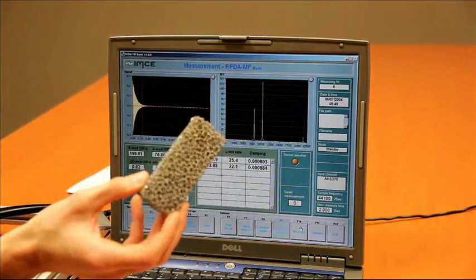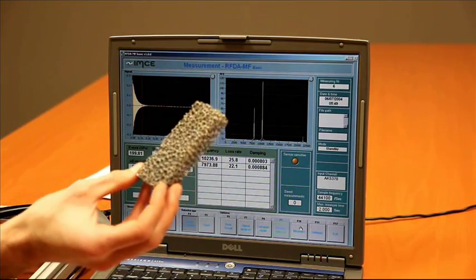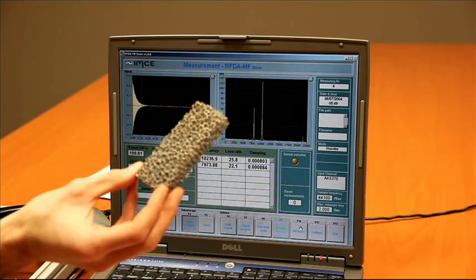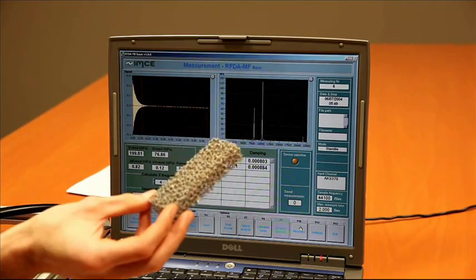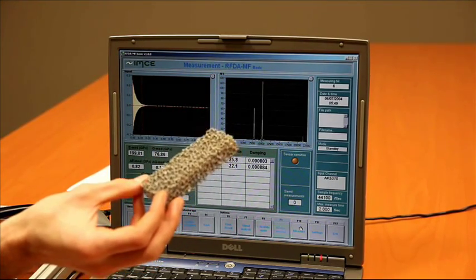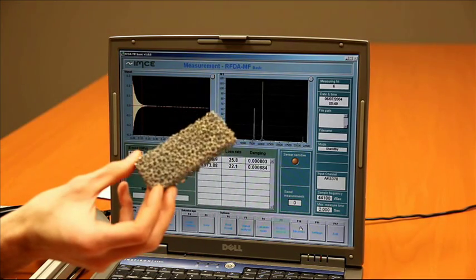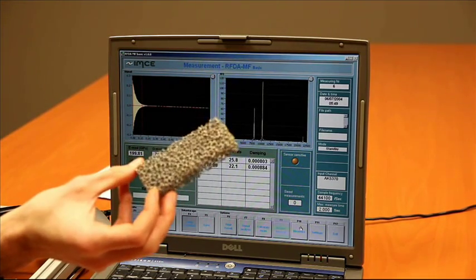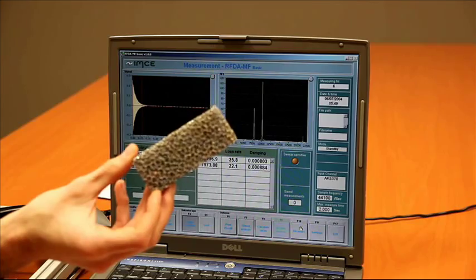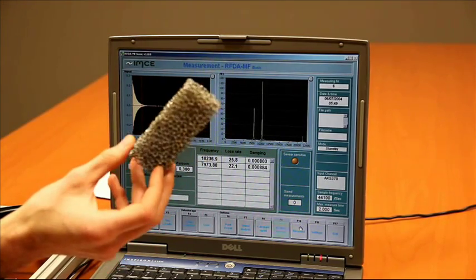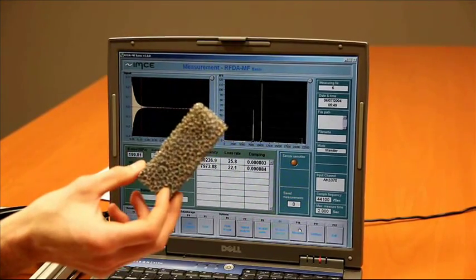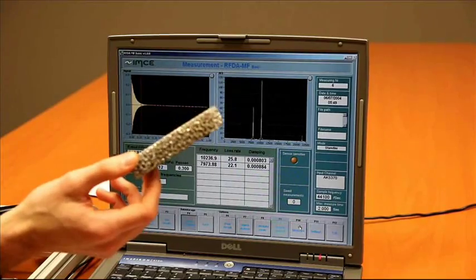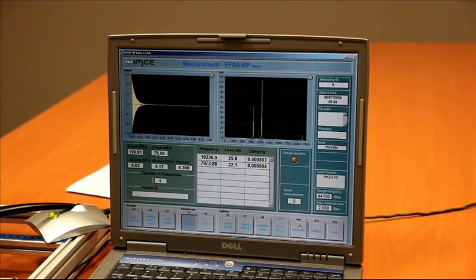And the big advantage we have over other techniques is when you tap this sample, we only apply very small forces onto the sample. So you won't crush any of the porosities. And therefore, you will also have a very good reproducibility of the elastic properties when you measure this type of material using the RFDA basic system.